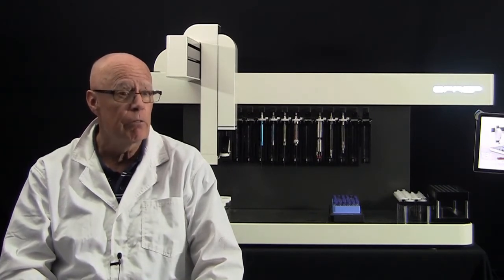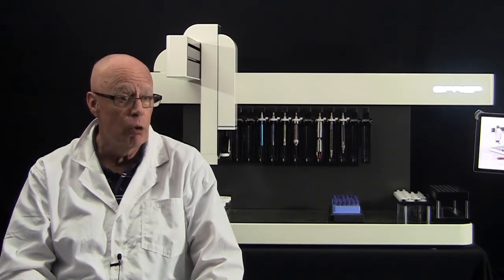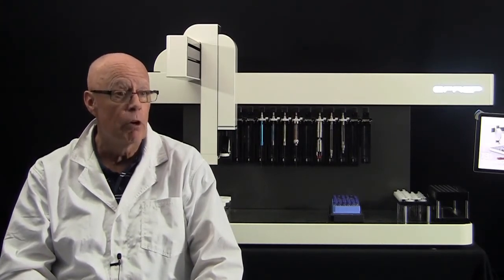The creation of the workflow is a one-off task and can of course be used again and again. This particular example workflow was created in about 15 minutes. So let's have a look at the ePrep in operation after the workflow has been built and saved.